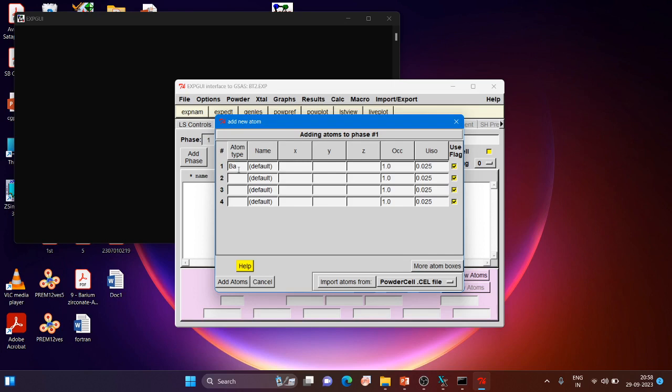Okay, so assume that I put 0.5 here, and then 0.5, and the third one, on the z-axis, I will just put some larger value, 0.58, because barium titanate is not a centrosymmetric structure. It is non-centrosymmetric. You cannot expect that the line of symmetry passes through the center. You cannot expect that in this type of structure. So I'll just put some elongation factor into this.